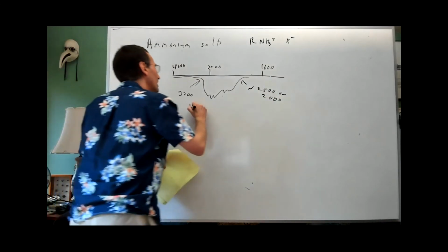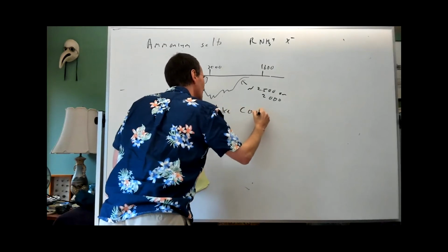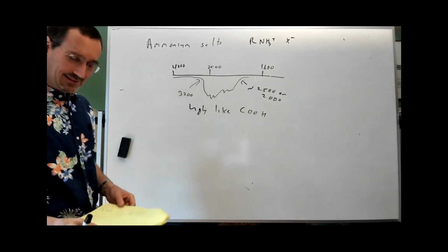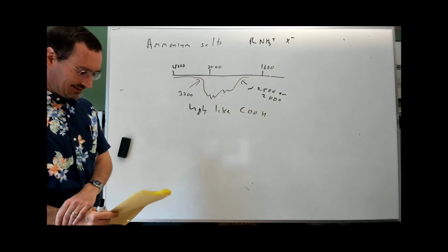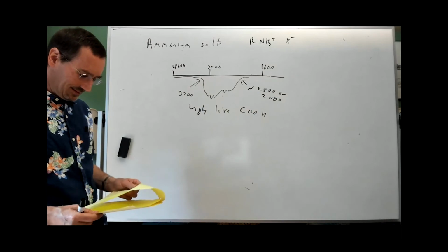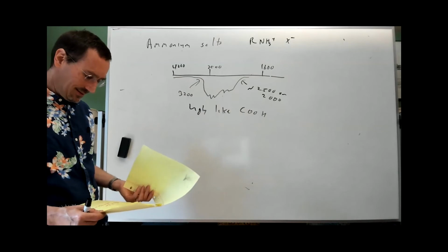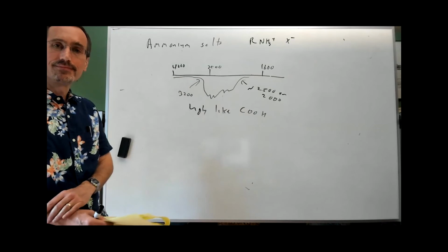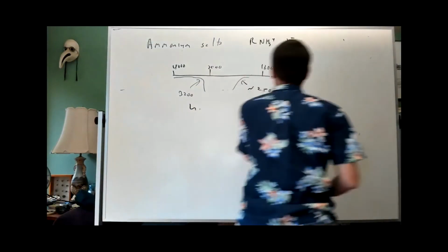So I'll say ugly like a carboxylic acid. Let me show you a few more and then we'll look at some real examples.